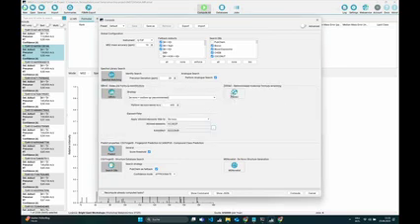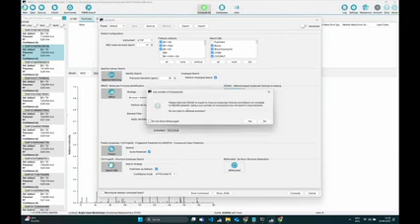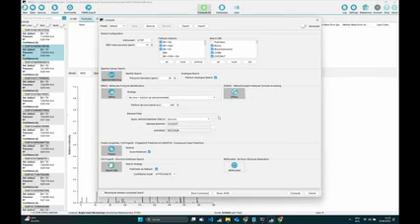Zodiac, Markus also quickly touched on. The thing about Zodiac is you want to enable it if you have complete runs that you analyze, and what is also important, if your machine is capable of it. If you have a machine that is not too powerful, you might want to disable it. If you click on Zodiac, it will also show you this warning. So you can click yes or no if you want to enable it or not.